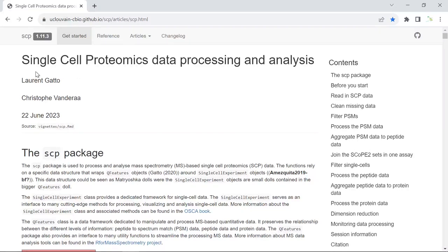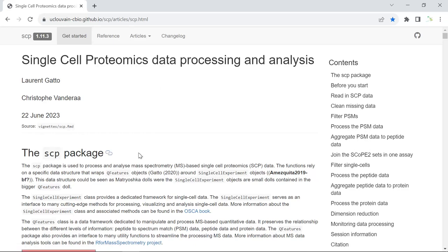Now I'm going to make videos to show you how to analyze single-cell proteomics data. Compared to single-cell RNA sequencing data analysis, single-cell proteomics technique is in the early stage for both data acquisition and also data processing and analysis. There are some packages you can use, but I think the SCP package is the best one to analyze the proteomics data.